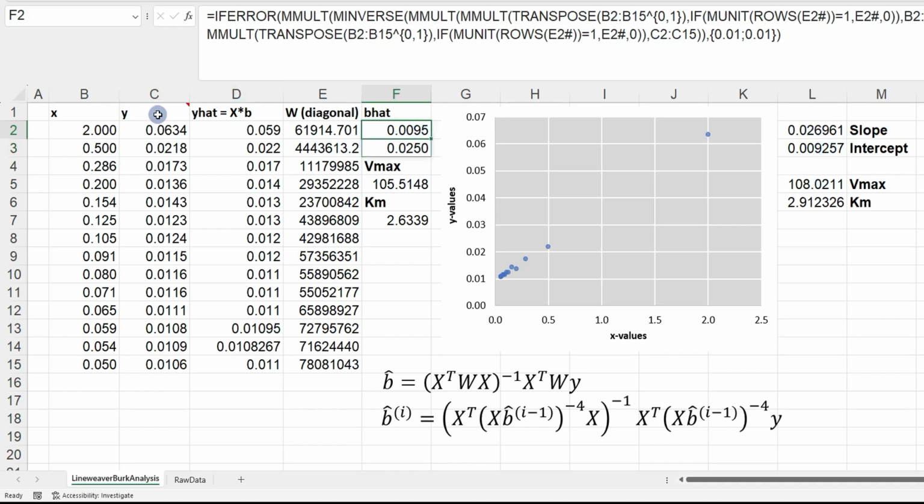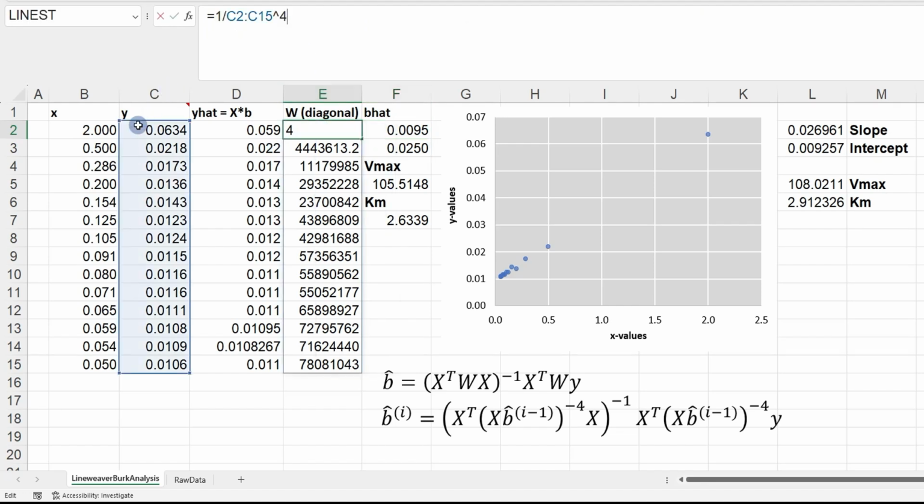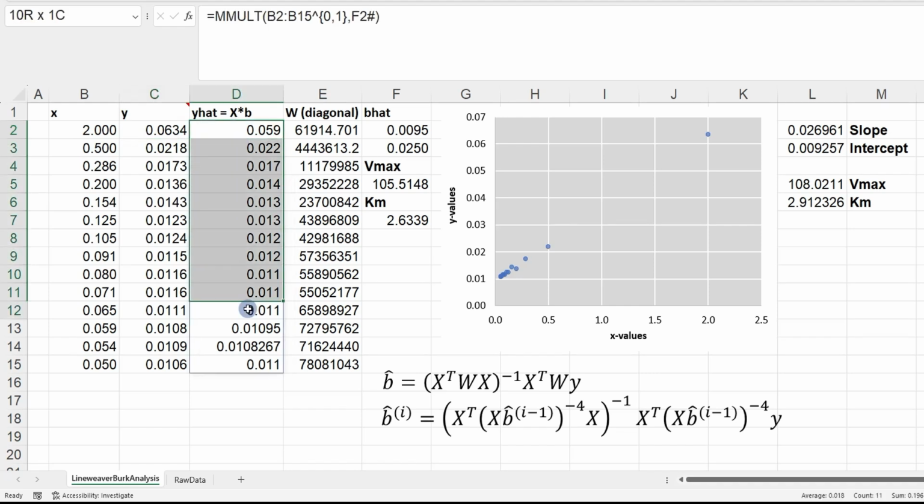Okay, so now here we use the discrete y values for the weighting. I think it might be a good idea to apply an iteratively reweighted least squares scheme here. So we do not weight by the discrete y values, which are not directly measured but calculated from the measured values. But we might apply a weighting that is related to the theoretical fit curve, so y hat.